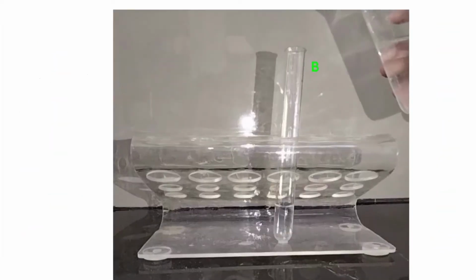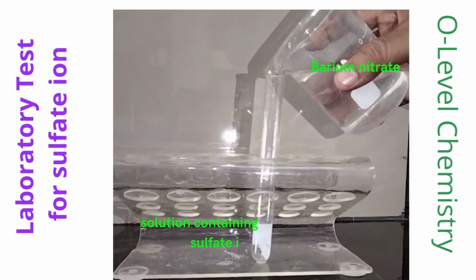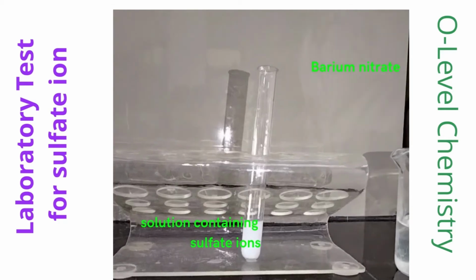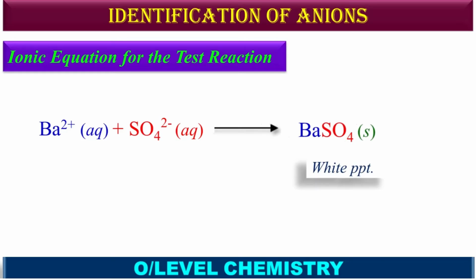mixed together, white precipitates of barium sulfate are produced. In this laboratory test you can see how this test is conducted. On adding barium nitrate into the solution in a test tube containing sulfate ions, white precipitates of barium sulfate are produced. Ionic equation for the test reaction: barium and sulfate ions from the solution combine to produce barium sulfate as white precipitates.